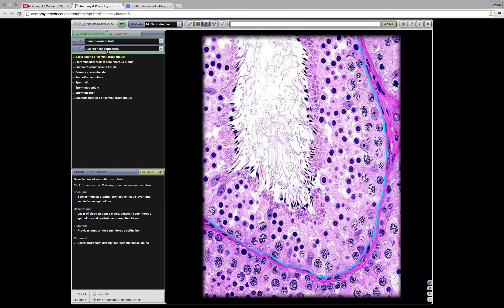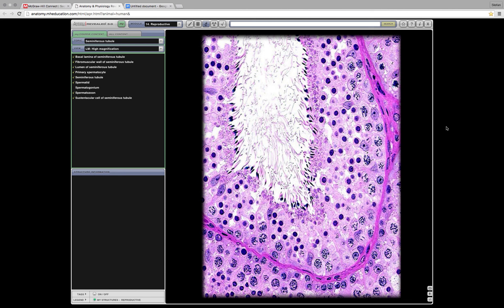Now you also have to know what all of these cells, what all the cells on page 65 release. And that's where page 66 and 67 come in. I'm not going to read aloud all of that for obvious reasons. You can do so yourself. I hope this video was helpful. Only reason I made it is because last semester we had a histology video provided for us, this semester we don't for some strange reason.